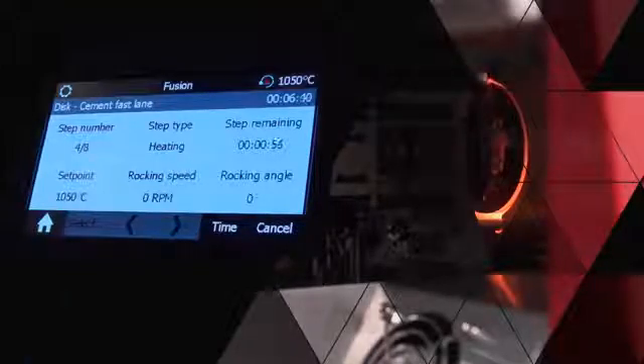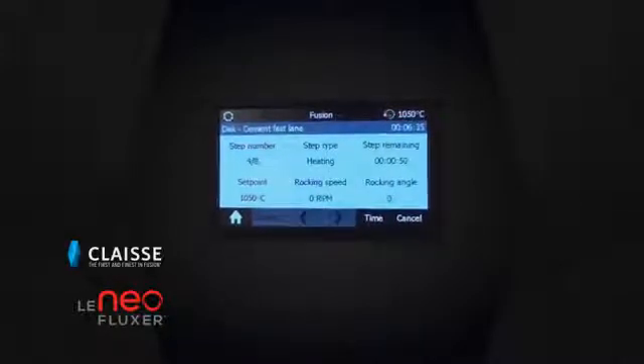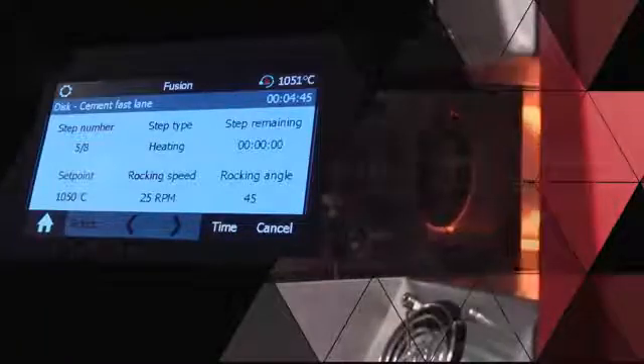The user-friendly touchscreen interface allows the adjustment of all settings and fusion parameters to prepare a wide range of materials such as cement, steel, ferro-alloys, catalysts, refractories, and mining ores.